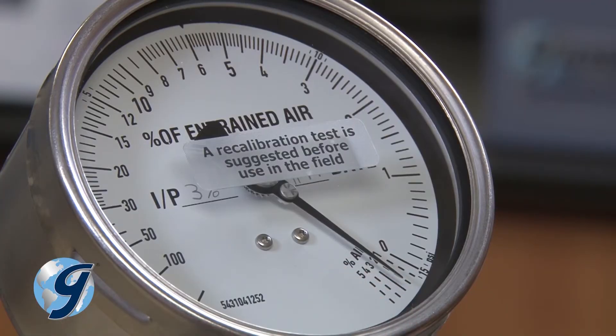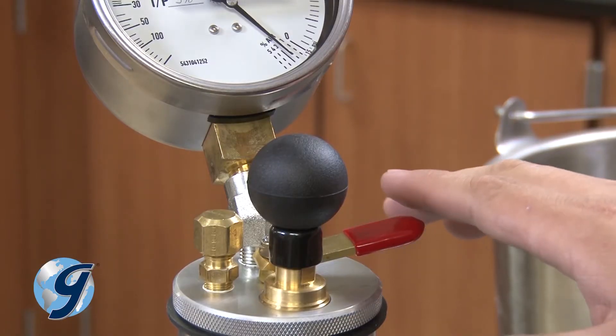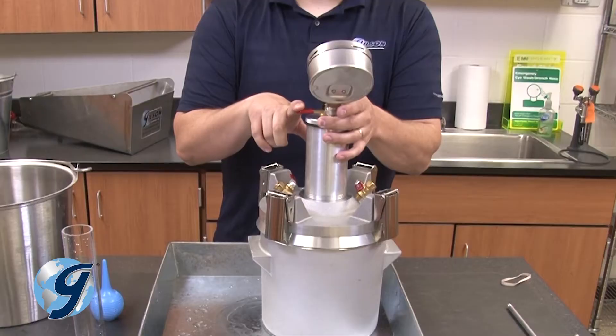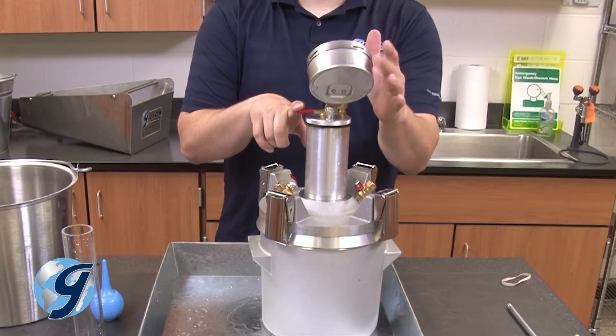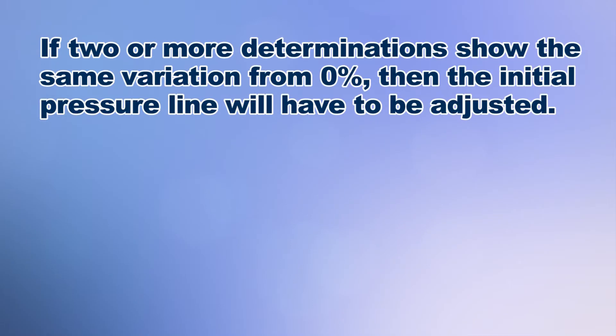When the gauge at the outset reads the predetermined initial pressure, press down on the needle valve lever to inject air into the base. As you hold down the lever, lightly tap the gauge body again to make sure that the gauge rests on zero.